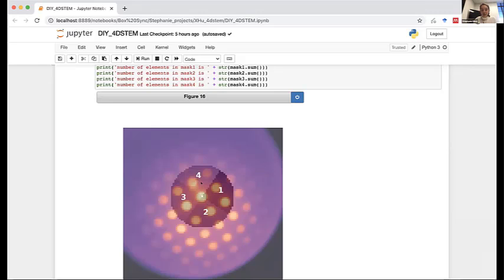And Python is a really good platform to be able to do this because you have so much tunability over your detectors. In a traditional DPC setup, you would have just the X and the Y, straight up and down. But I've built this specifically so you can tune the outer diameter of your detector if you wanted to bring the radius of your sphere in or out. And then you can also rotate it. So you have two lines here, and the way I did it is by creating lines with point-point form. I defined a second point. We know the first point already because we found the center of our diffraction pattern, and immediately that defines our first line. And then using a matrix, I can rotate that by 90 degrees. And then I have two lines that are perpendicular and can use that to divide up my circle into 4 detectors. And then, like I said before, this is very tunable.